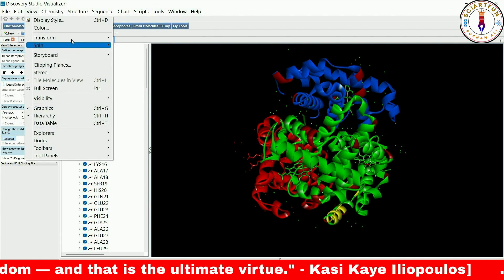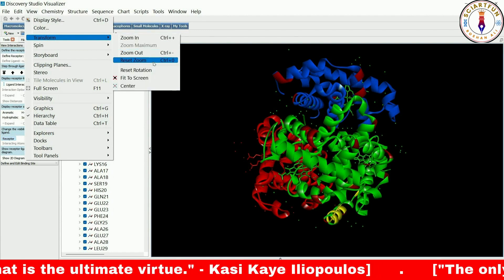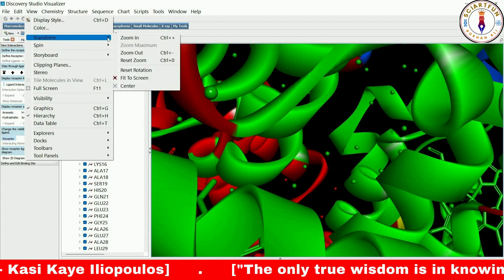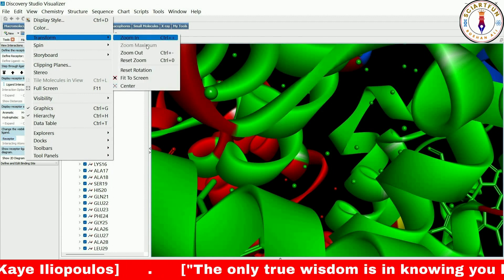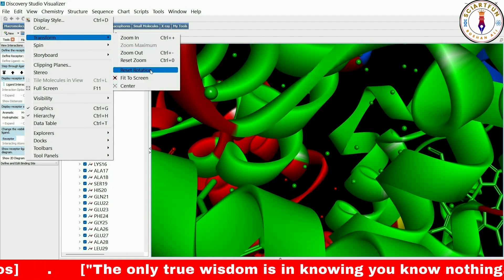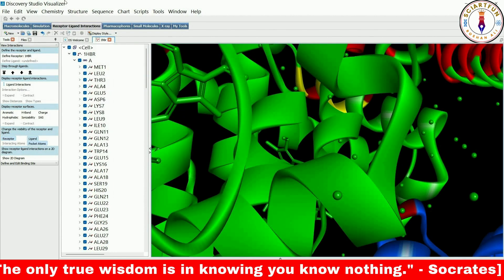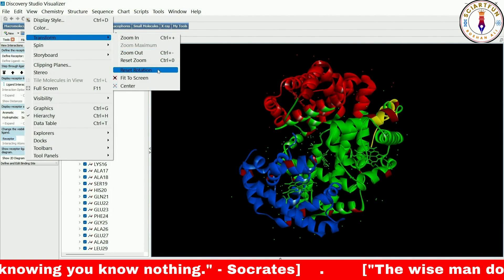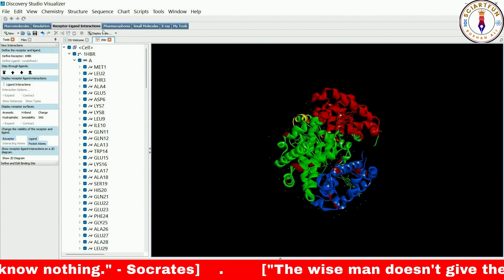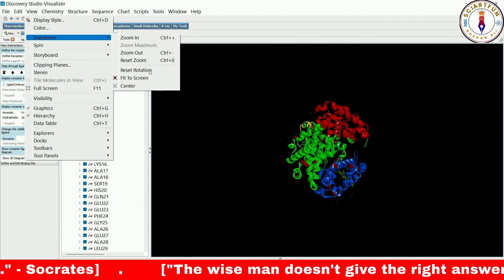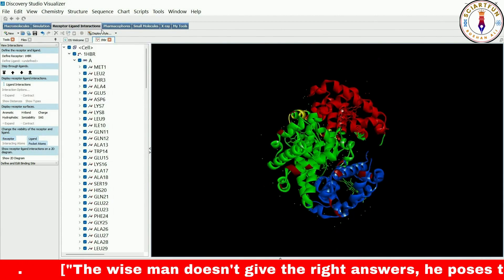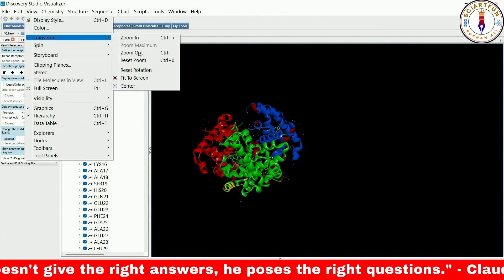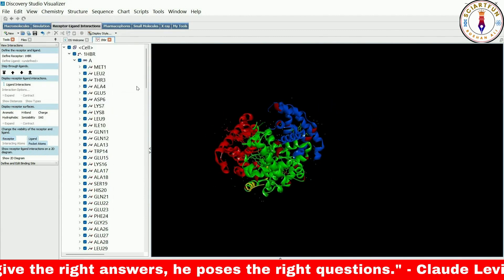The Reset Zoom option resets the zoom level to its default. The Reset Rotation option resets the orientation of the model to its starting point — if you have rotated the model, clicking Reset Rotation will return it to its initial position. The Fit to Screen option will fit the model to the screen window size; if your model is off-center and you want to bring it to the center, you can use this option.